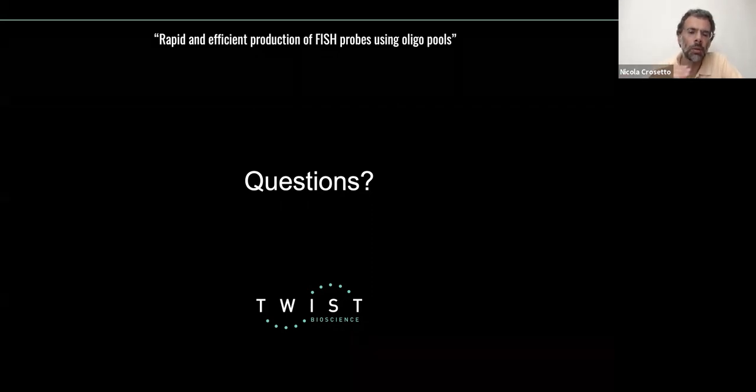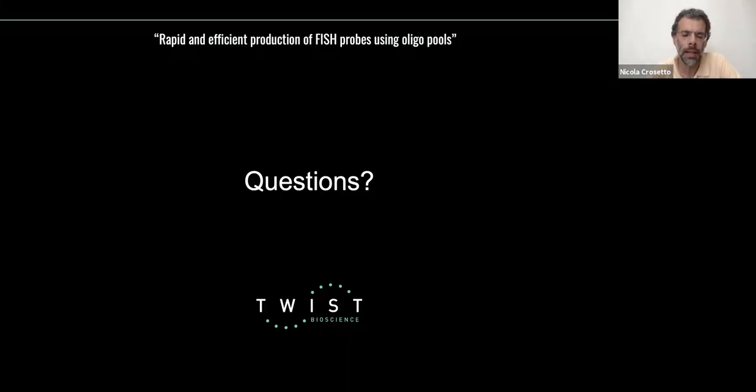And so in order to make single-stranded DNA, we really need this combination of in vitro transcription and then reverse transcription.